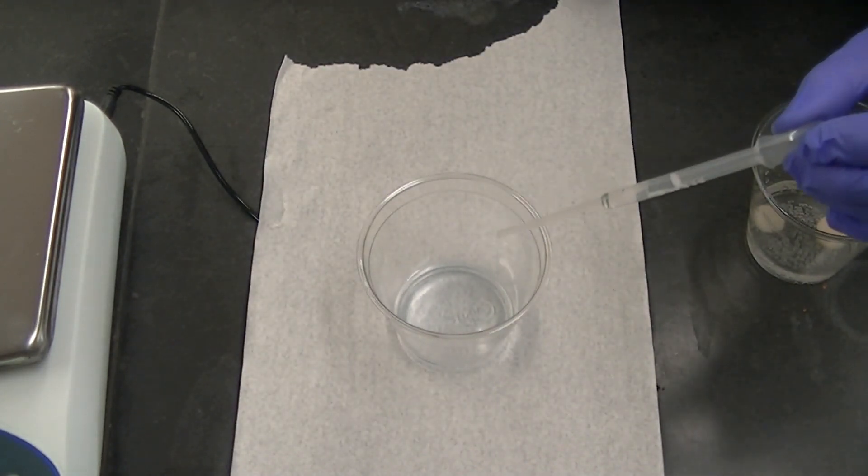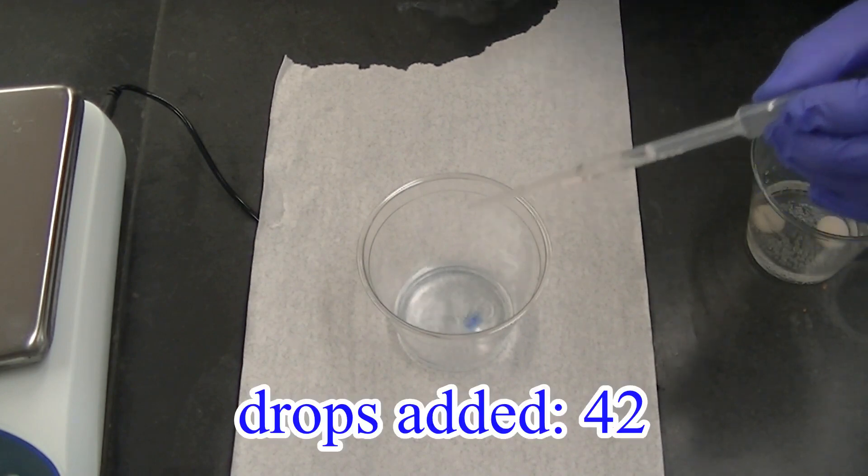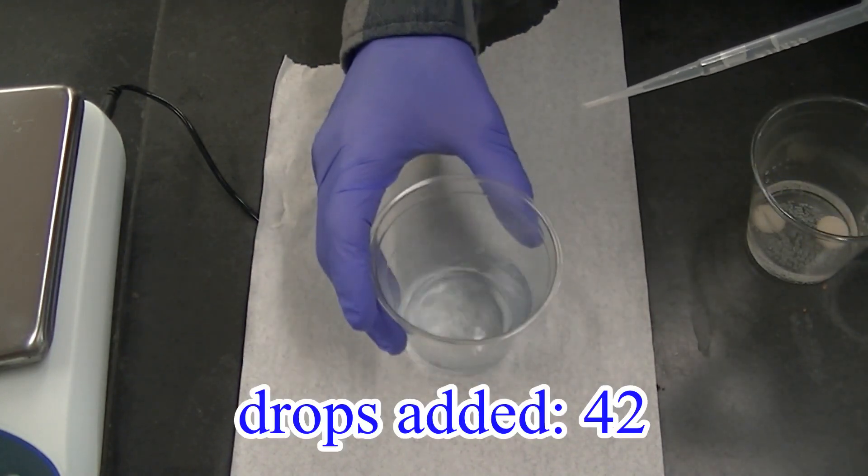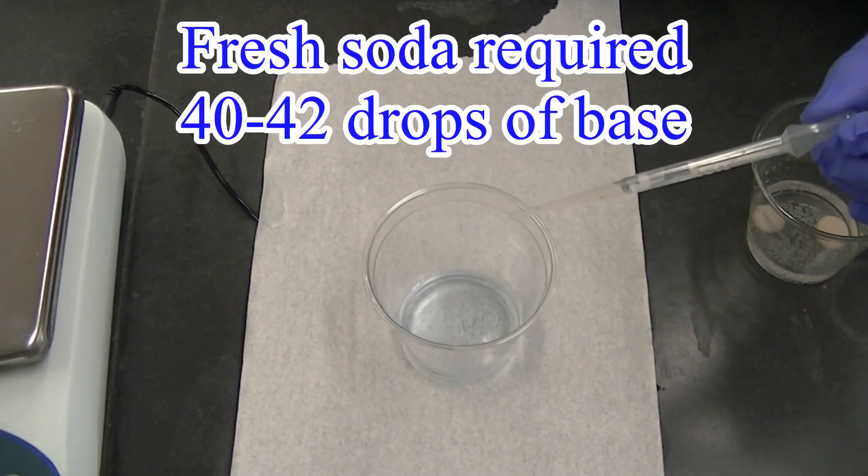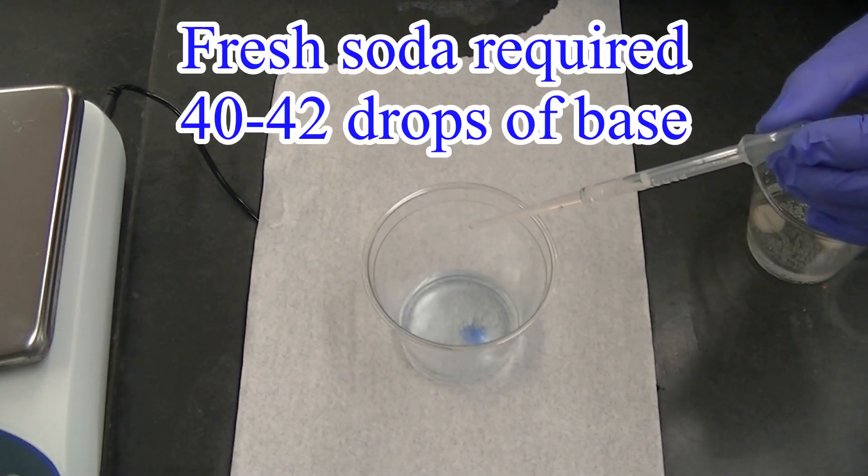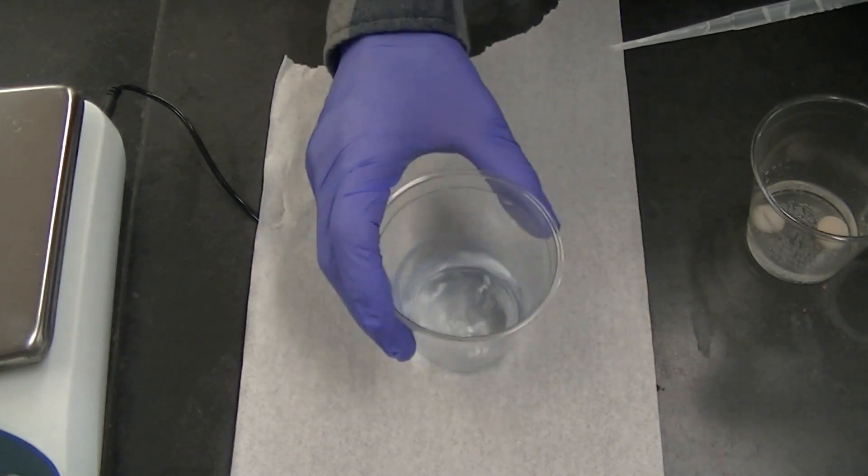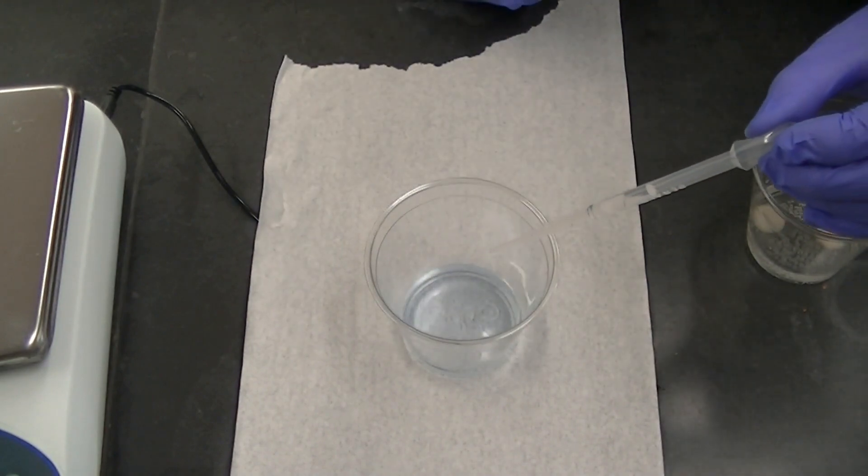You see the blue color? Let's add another one just to be sure. Sure enough that blue color is persisting. It looks like we've neutralized the acid in the soda. I'll add another drop and sure enough we're seeing the blue color get darker as I continue to add base.